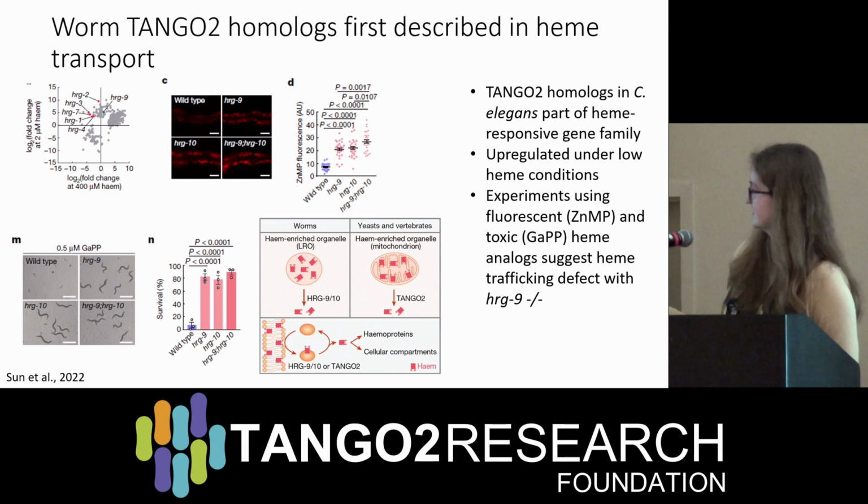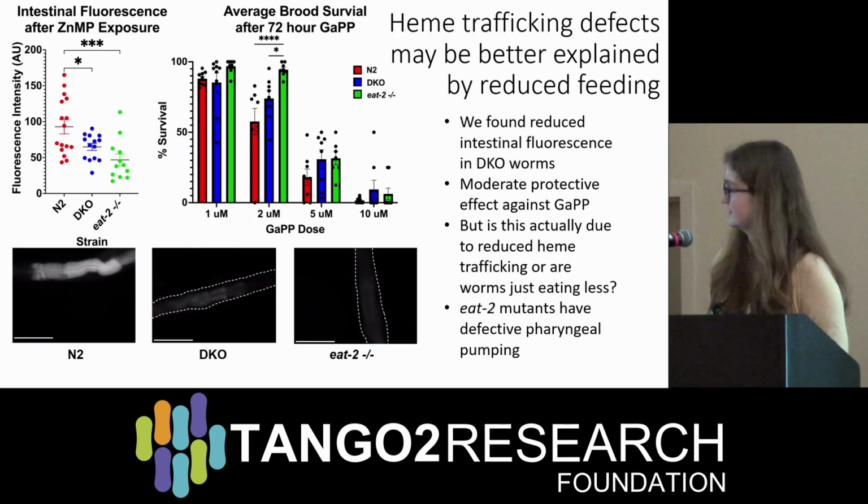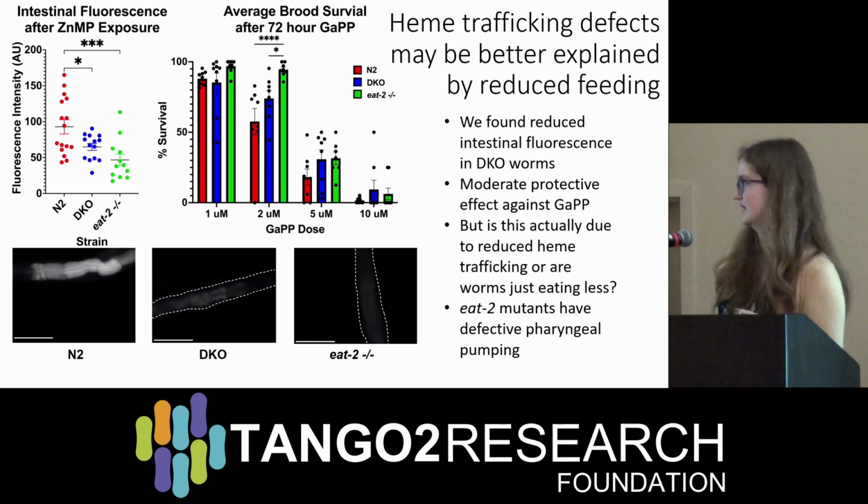So we were able to get a hold of the worm model that this lab created, so they very generously shared that with us. And we took a look at some of the same experiments that they did. And we got some different results. So the first thing we tried is we tried that experiment with that beautiful red compound.